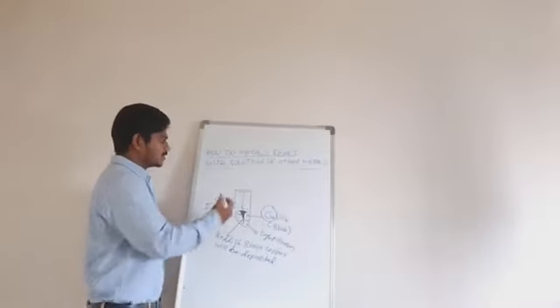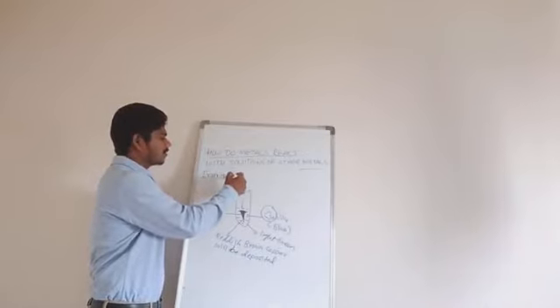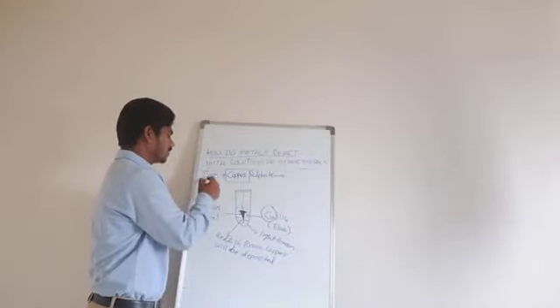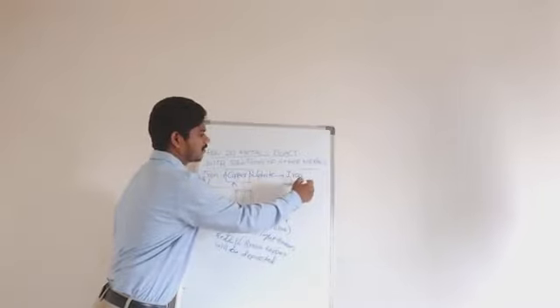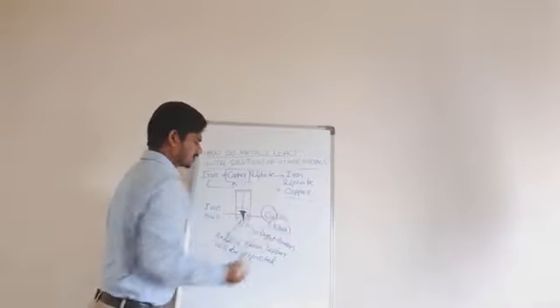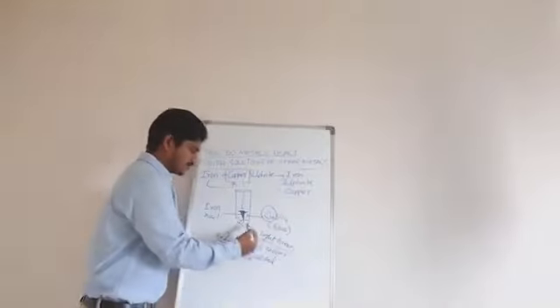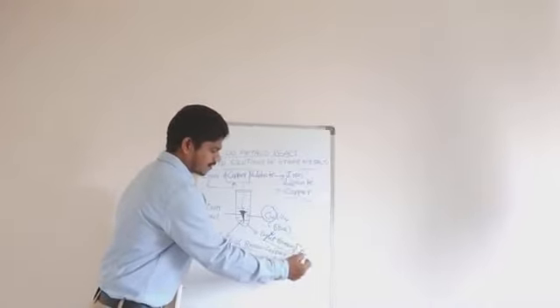I hope you understood. So here iron is more reactive than copper. When you make iron and copper sulfate react with each other, the iron is going to displace the copper and becomes iron sulfate, and the copper is pushed out, it is displaced out. So that copper from the solution will appear as a reddish brown, and the change of the blue color into light green color is because of the formation of the iron sulfate.